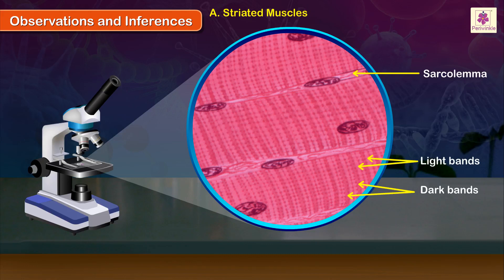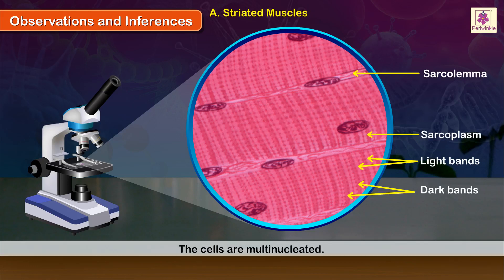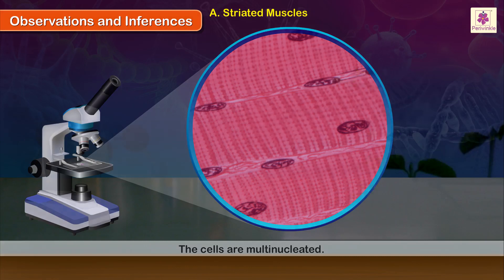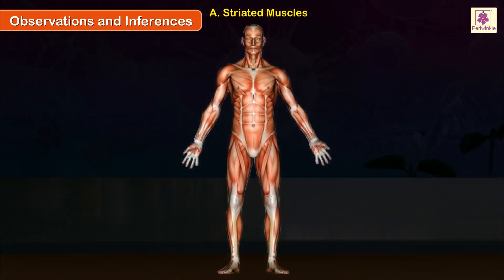Within the cell membrane lies the cytoplasm, which is called the sarcoplasm. The cells are multinucleated; the nuclei lie towards the periphery of the muscle fiber. Striated muscle fibers occur in the skeletal muscles.